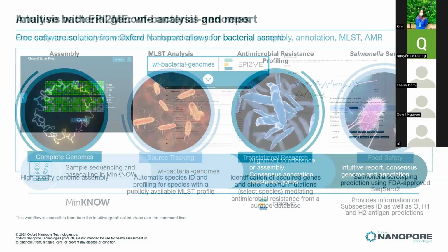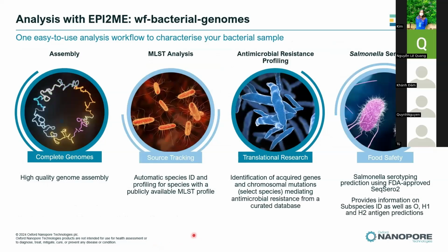So it's free of charge. Does it also include CPU and RAM? Are they only available to download, or can we run it in the cloud, or do we have to pay for the cloud? So you can run it locally. You can also run it in the cloud. Both are free. So it means that the computation using the CPU and RAM is also free, and storage is also free. Correct. Okay, perfect. Thank you.